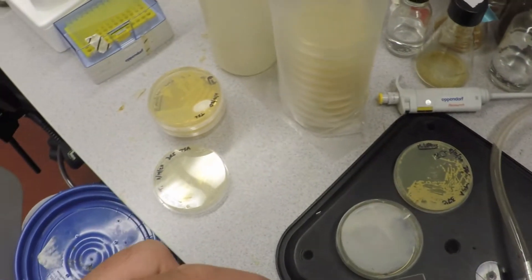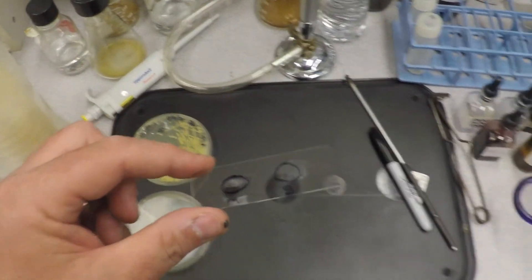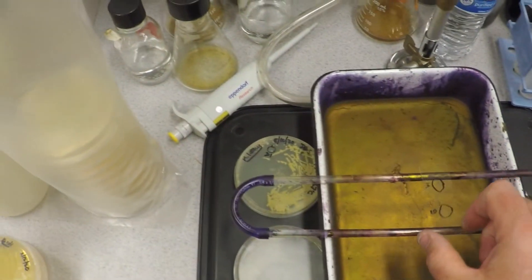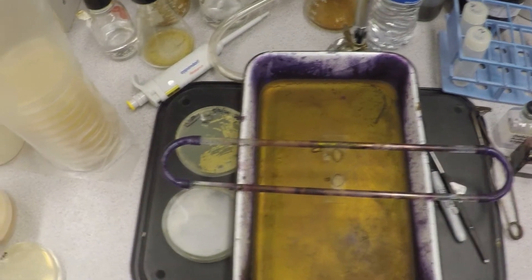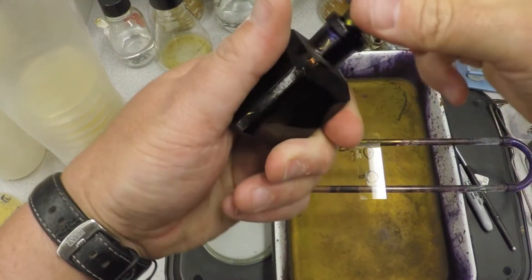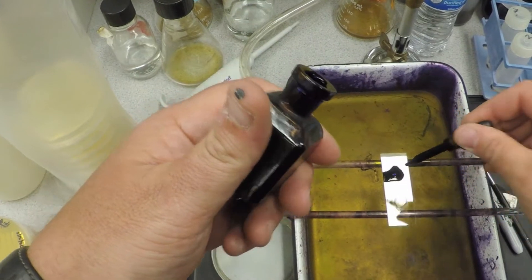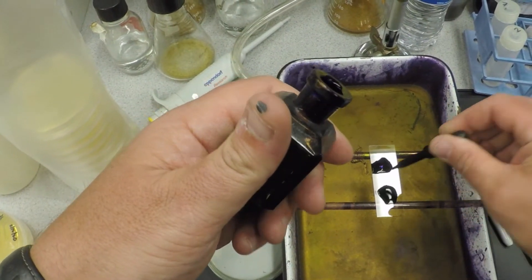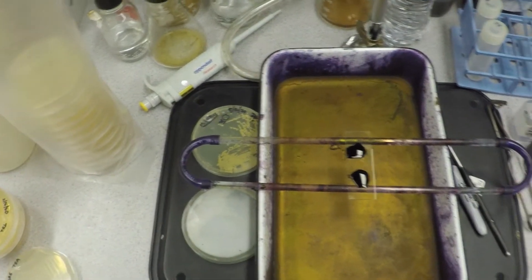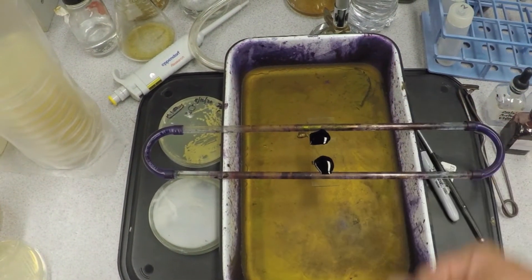Now you're done with the flame — we can turn that off so we don't die. Let's move this over. Now we begin the actual procedure. The first thing you do is add what's called crystal violet. Crystal violet is a general purpose stain; it's purpley-blue in color. You just put it right over the surface of your cells — don't be shy, but you don't have to go crazy.